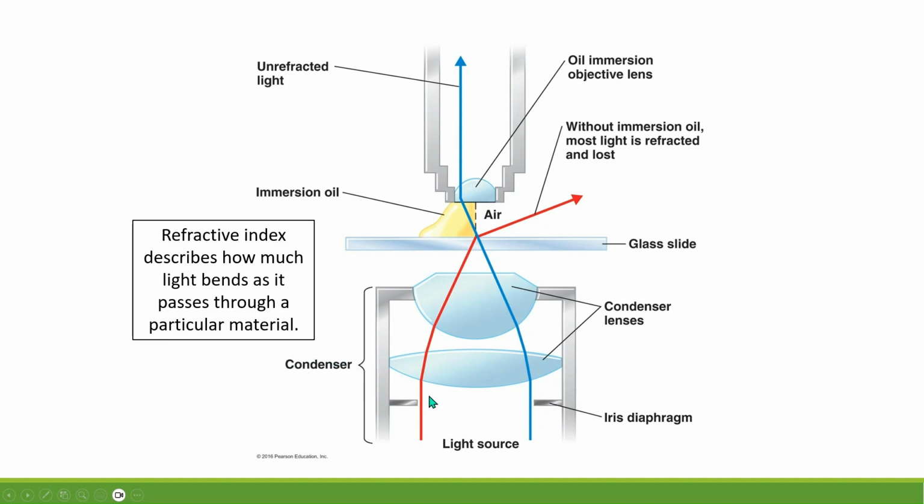And above that we have this condenser here that's going to direct the light towards your specimen right here, pinpointed in the middle. And these glass lenses, because of the shape of them, when light hits glass, a solid, it bends the light towards the angle of that glass. And as we traverse through these glass condenser lenses, they don't magnify like an objective lens, they just curve the light over. What we get is light that has a very specific angle.